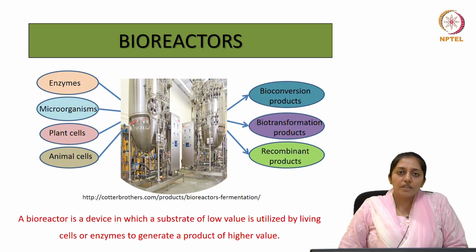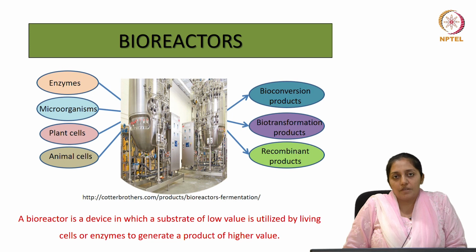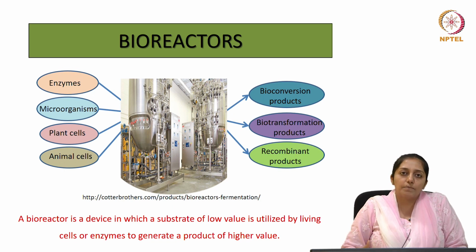So, as you can see on the slides, the title of the slide is Bioreactors. It's important to know what is a bioreactor. So, in fermentation industry or biotechnology based industries, bioreactors play a crucial role. I would rather say they are a foundation stone for these industries. Now, what are bioreactors? You can call them devices in which a substrate which is of low value is utilized by living cells or the cellular components which we call biocatalysts, named as enzymes, to generate a product of higher value.